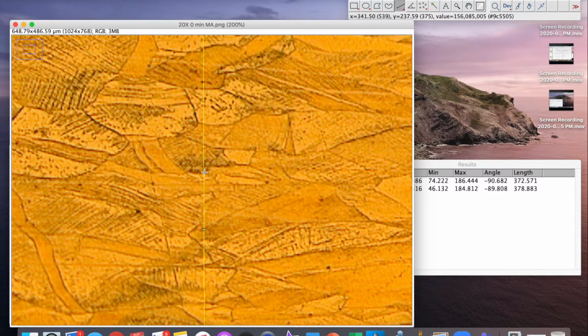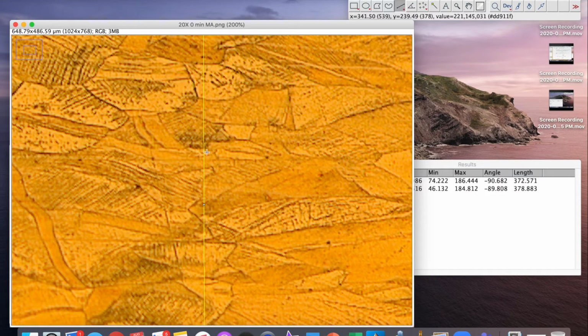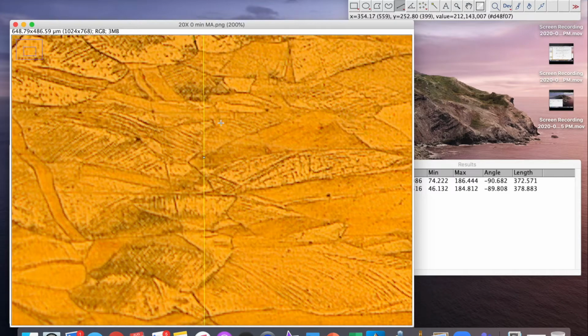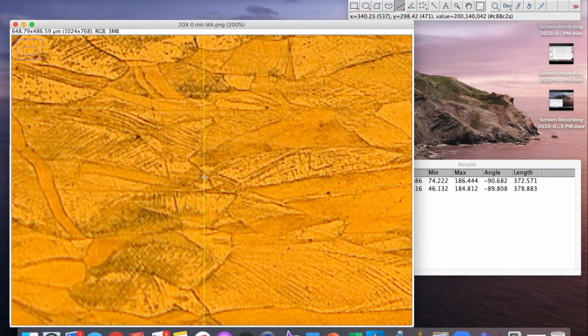And you'd want to keep track of these as well. And you keep going, and again, try to differentiate these different features from one another. I will say it's pretty hard. I took a real image that we had from last year, and you can see that this area is a little fuzzy. How do we count that? To me, it looks like we have one here, another one here. I would probably count this. It looks like this is a boundary too.